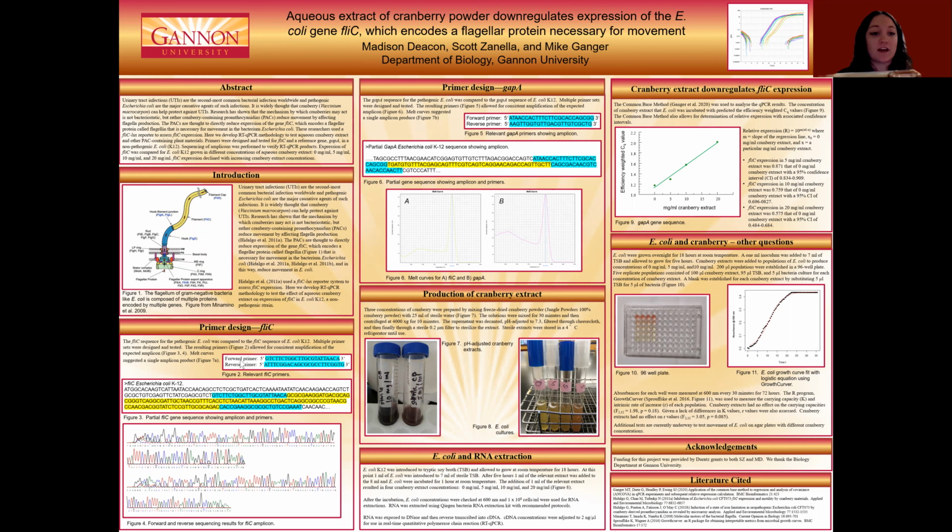Previous research that we looked at used pathogenic E. coli, but for ours, we wanted to use a non-pathogenic strain called K12. We had started with the primers used on the pathogenic strain in other research, but soon realized that it does not work as well with our strain. In order to get the proper primers, we had to put the strain through amplification and send it out in order to have the primers produced for us.